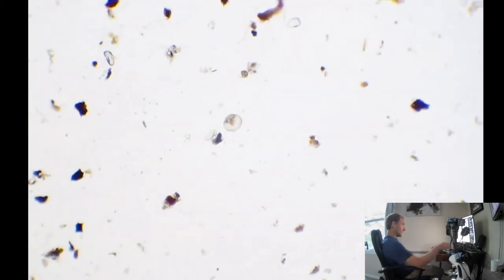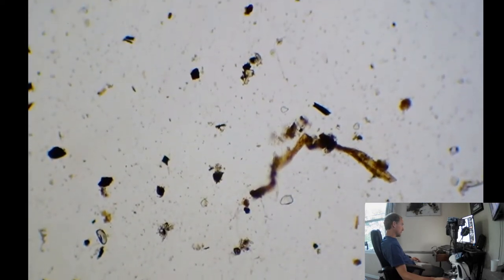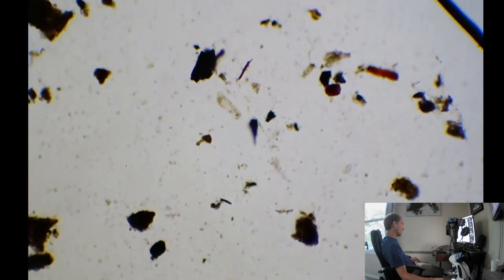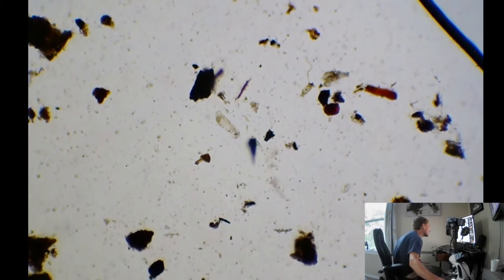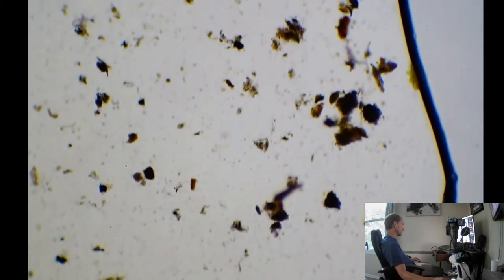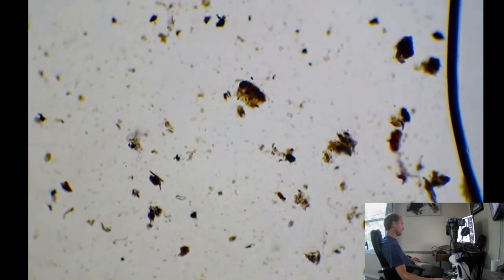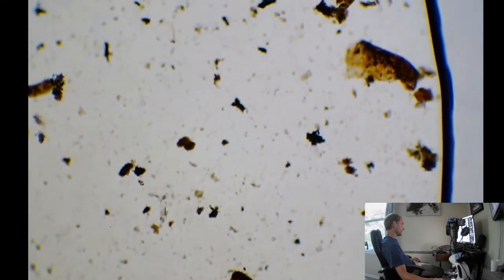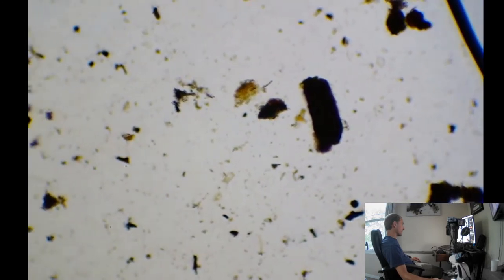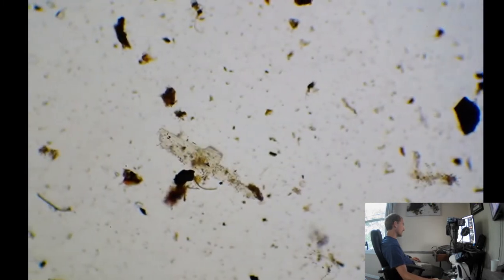Back out to the scan. Less light. And see, we're going up. Bunch of big plant matter there, organic matter. Organic matter and some little hyphae. We got an air bubble. Thought I saw something move. A lot of good aggregates. Can't complain so far. Looks like some fungi in those aggregates. Organic matter.